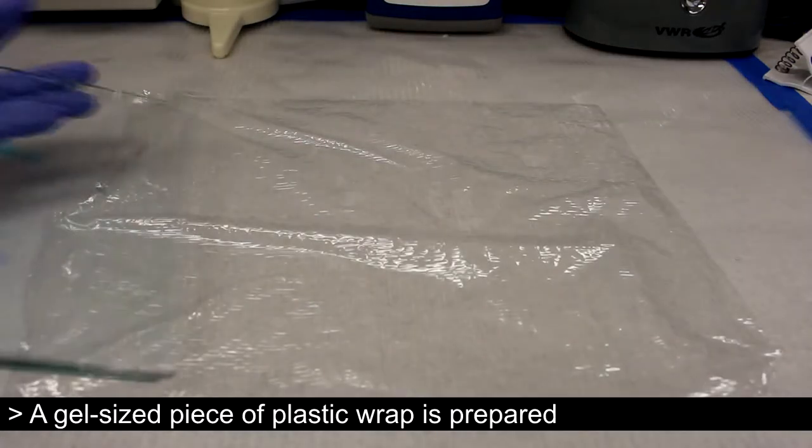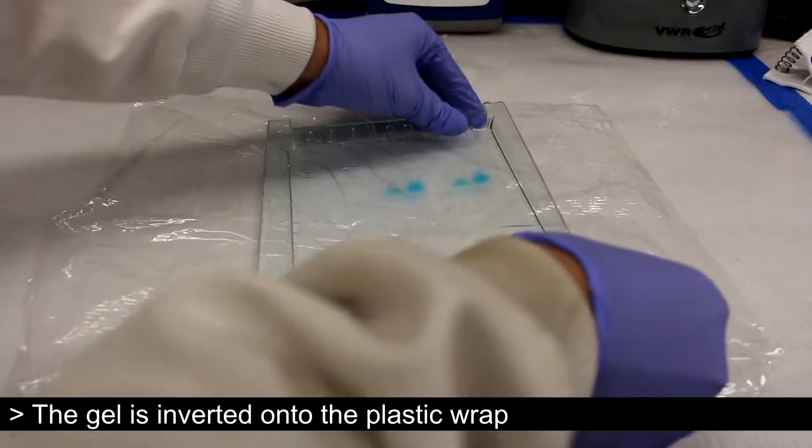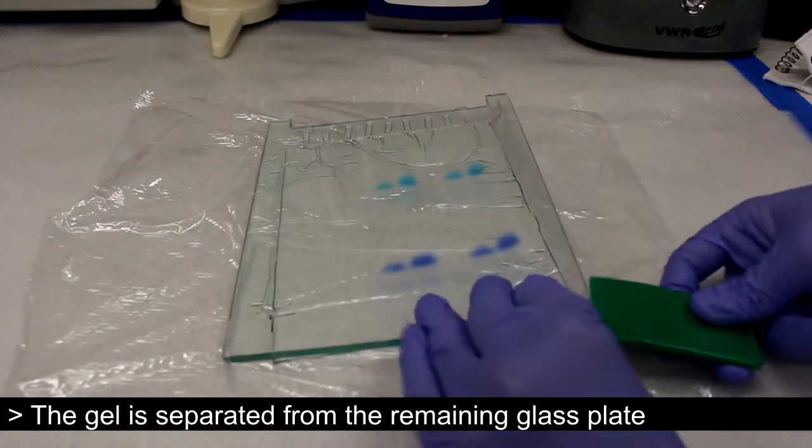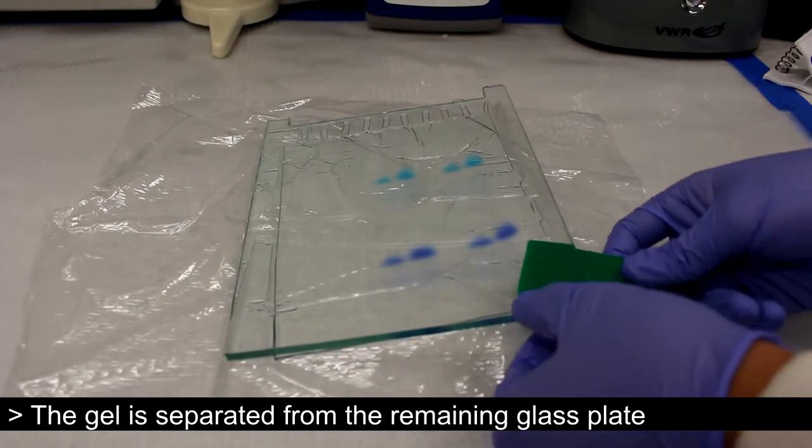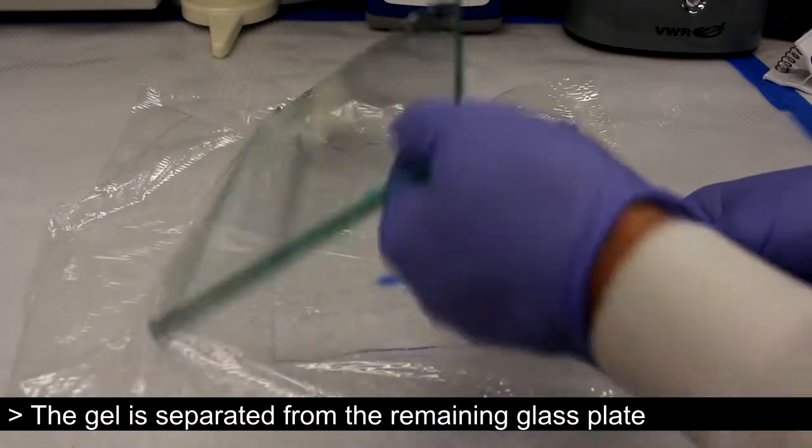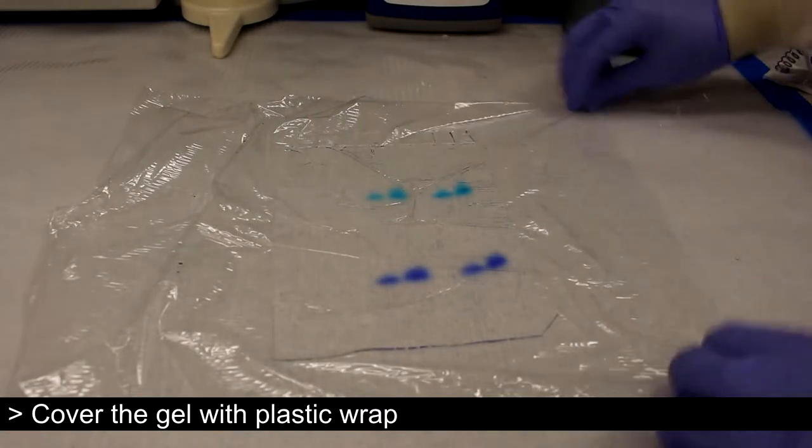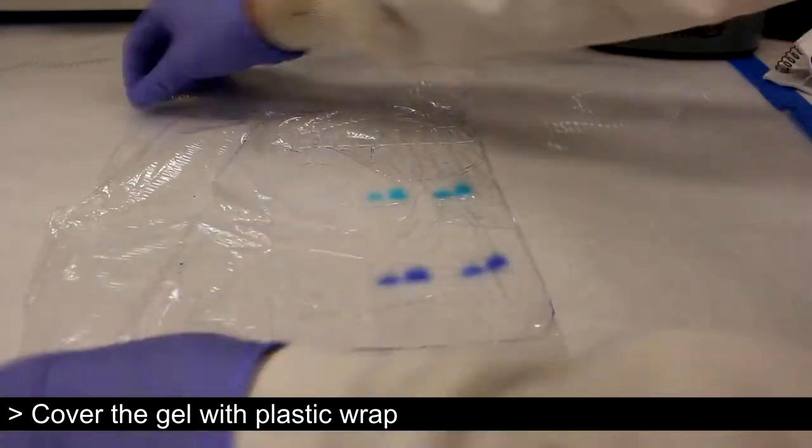A piece of plastic wrap is prepared to which the gel is placed. The gel is then separated from the remaining glass plate. A corner of the gel is cut away to mark orientation. The gel is then wrapped up.